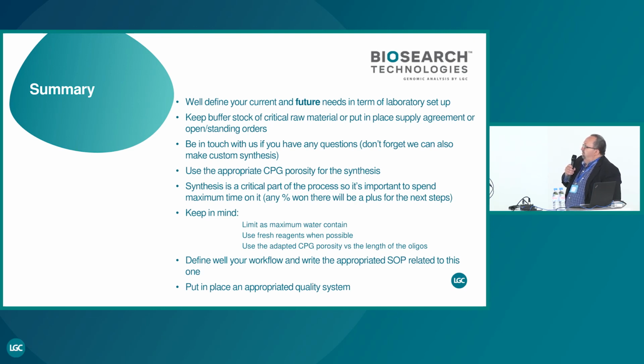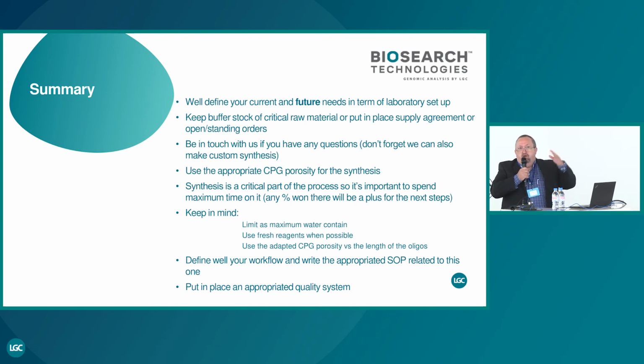And define well your workflow. So it means, okay, I will do first the stock management, synthesis. After the synthesis, the cleavage and deprotection will be done there. Then I will do the quantification, then the purification. Have a clear workflow. Do your process well. You have to establish your ISO.